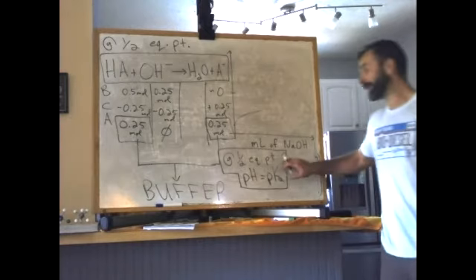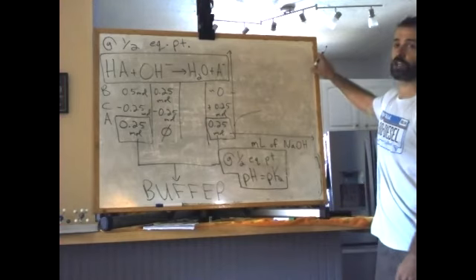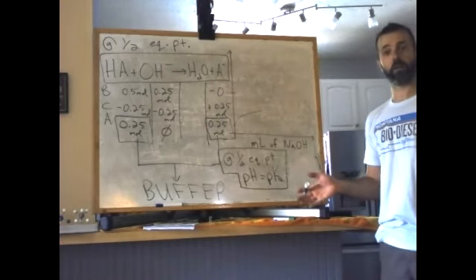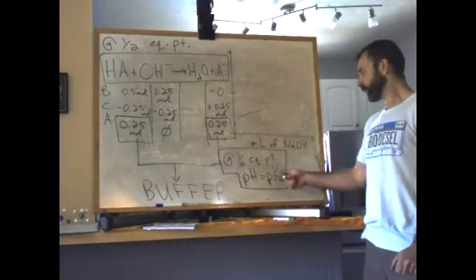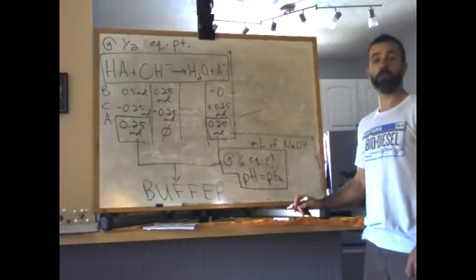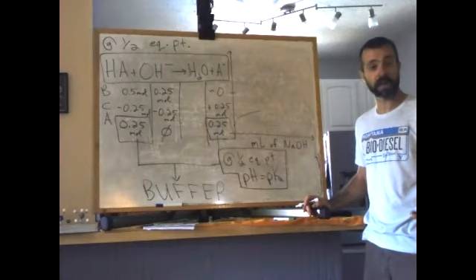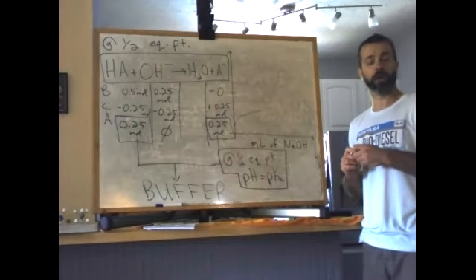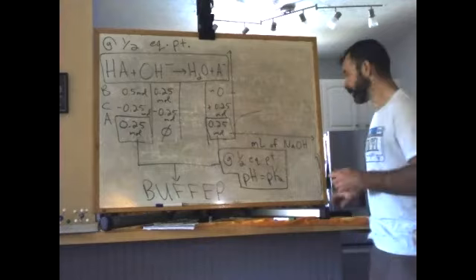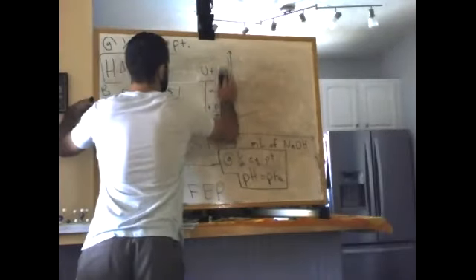Okay, we need to use this idea to identify what the unknown acid is. Because if we measure a titration curve, we're going to figure out where the equivalence point is, so we know where the 1/2 equivalence point is, so we can find the pKa. If you know the pKa, you can look up values of pKa's of unknown acids, and you can identify, or at least have a good guess, as to what the unknown acid is. Okay, so let's get back to our titration curve, and what is this going to look like?